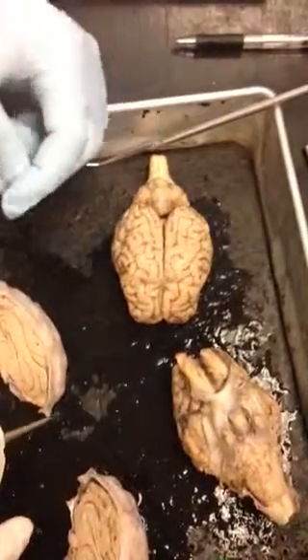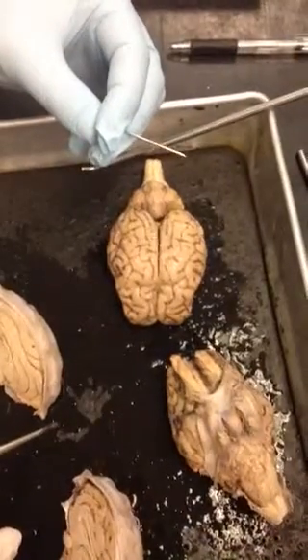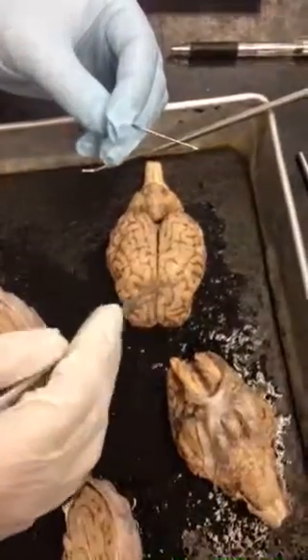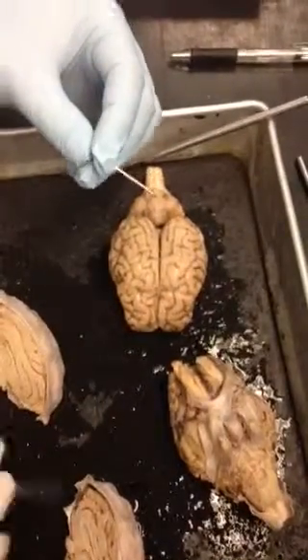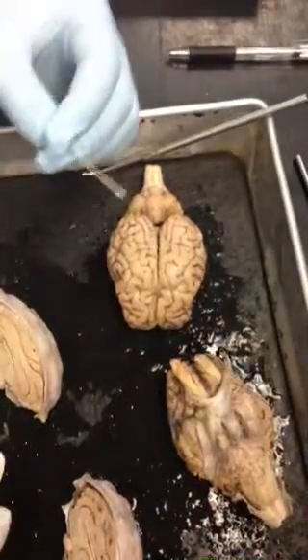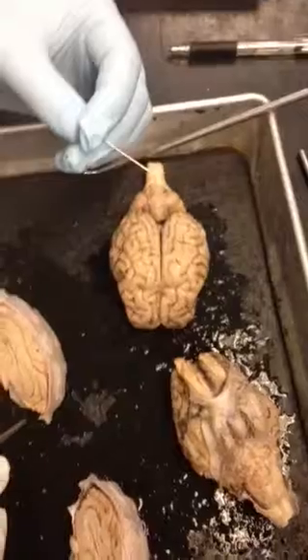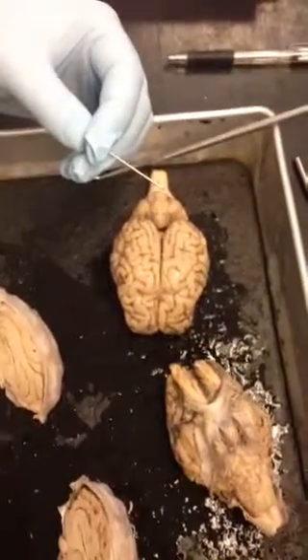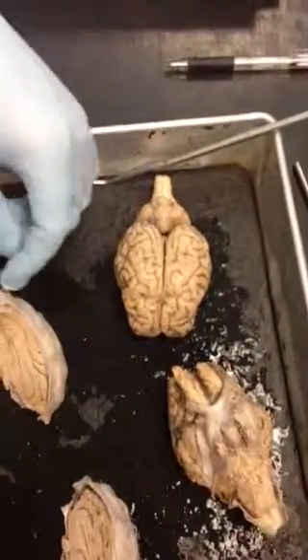So what is the pre-central function in? Motor, yeah, primary motor. And then behind it? The primary sensory. Yeah, somatosensory, primary somatosensory. So the front is primary motor and the back's primary sensory. I'm pretty sure that's right. I don't know. Did we have it switched around? Yeah, I think that's right.